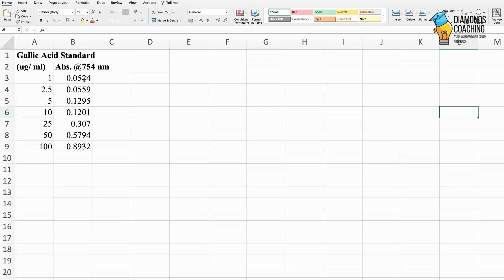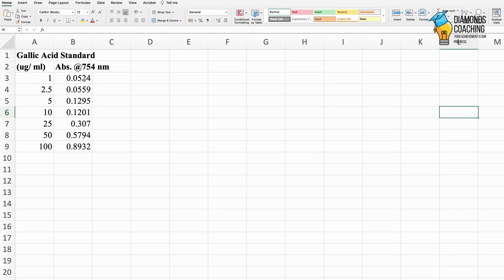Today we will see how to make a standard graph using Excel. I have already shown you the calculations of total phenolic content in the previous video, and many of you commented asking me to show you how to make the standard graph and from where the y = mx + c equation comes from.